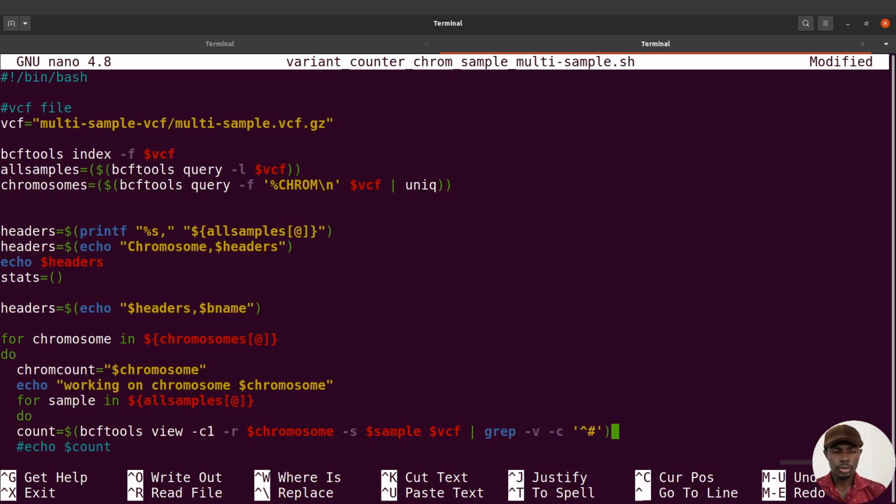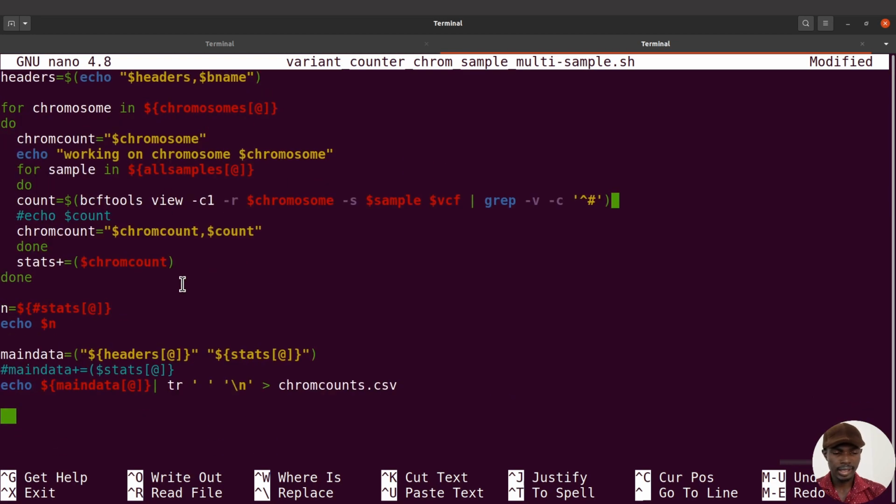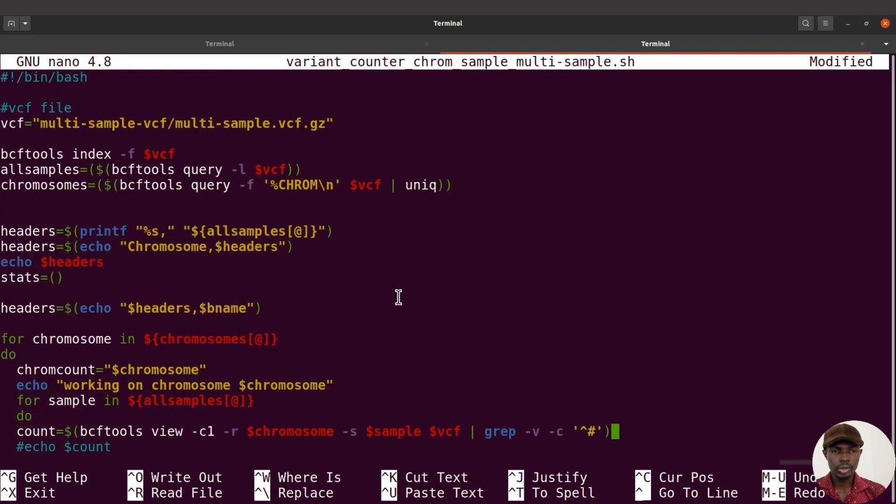Now, let's proceed. So let's continue. After getting your samples and chromosomes, the processing starts, and then you get this output. This is the final output you get, which has the information. All right. So let's execute the script.